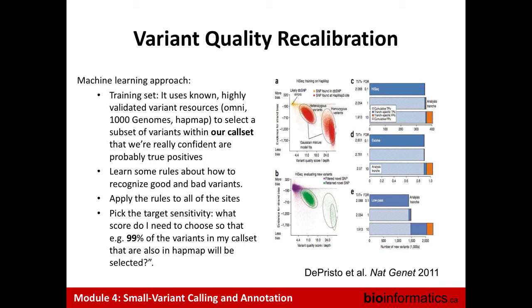How many VCFs would you start off with? How many samples? Because I will have one VCF for that. Yeah, how many different samples would you choose? I would start with between 20 and 30 samples. 20 to 30. Okay. But the more, the better.